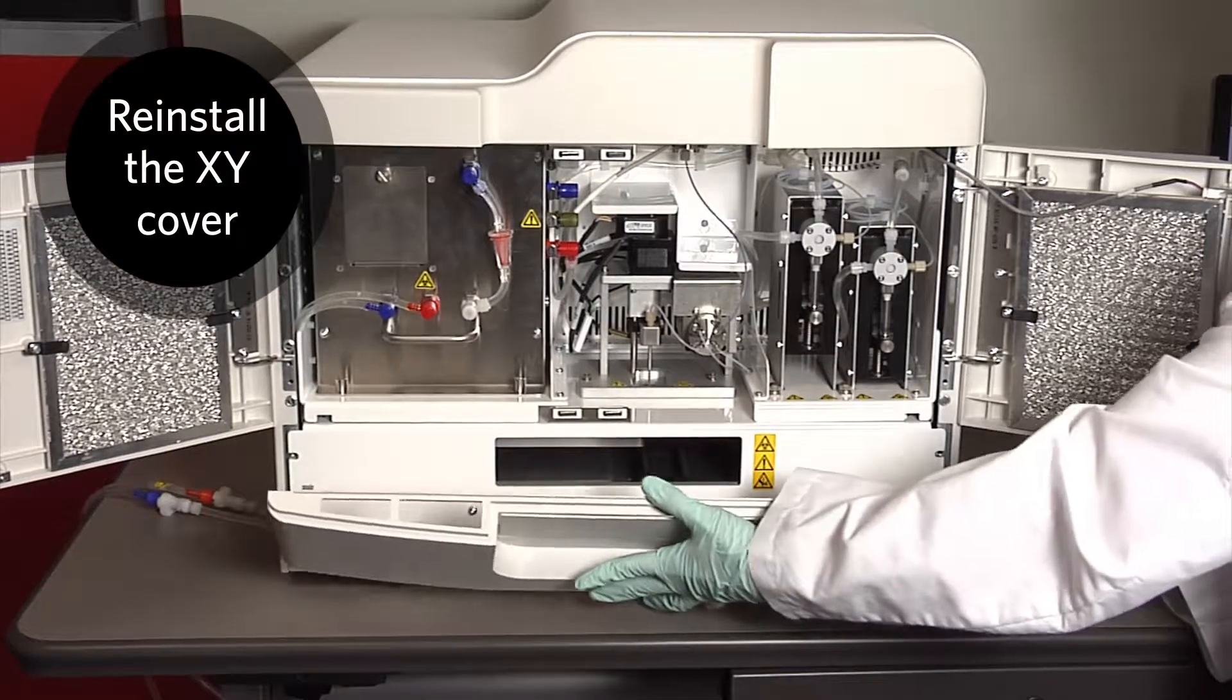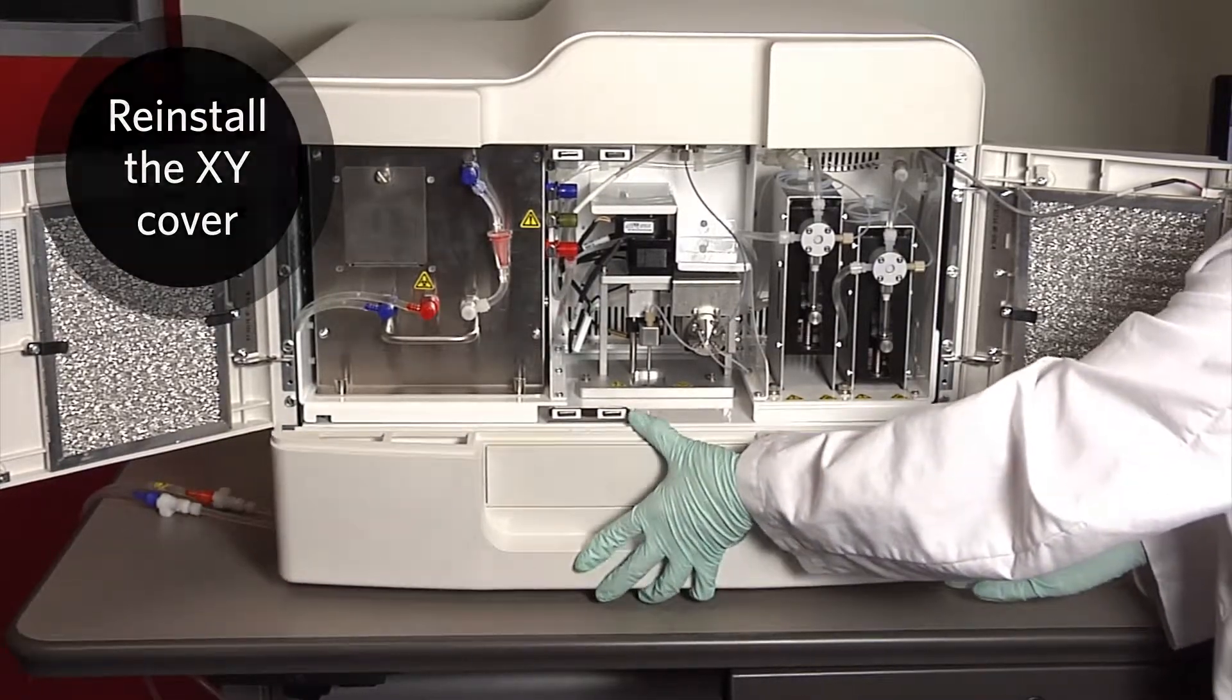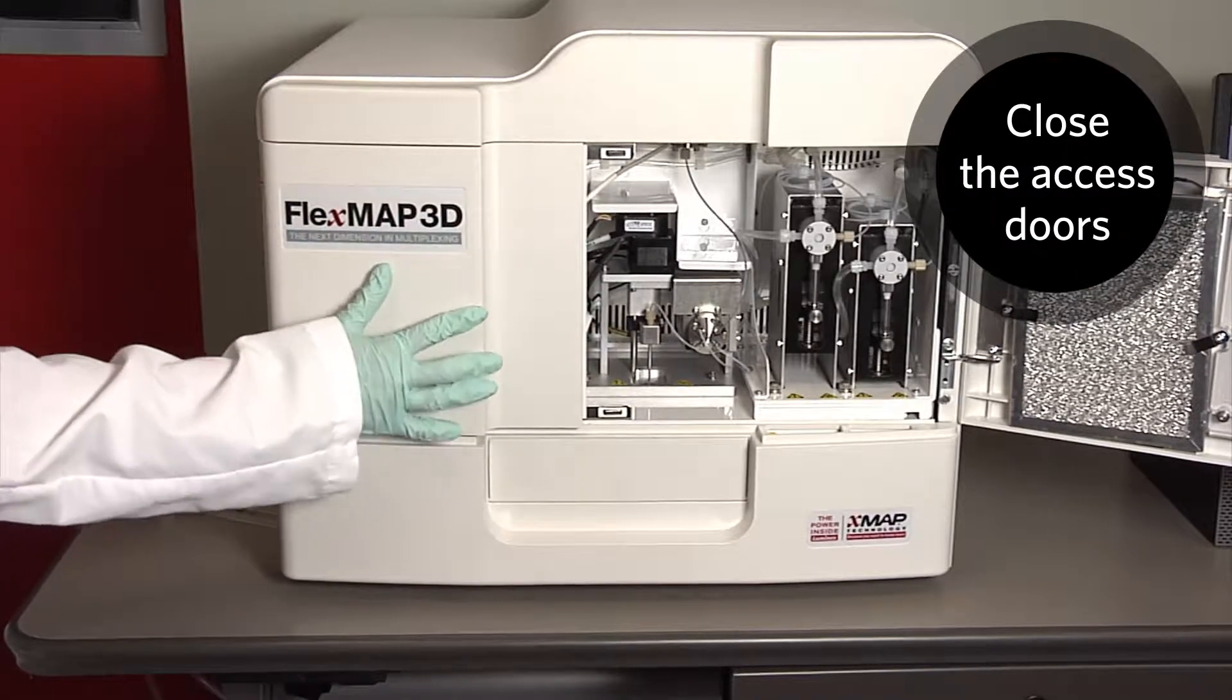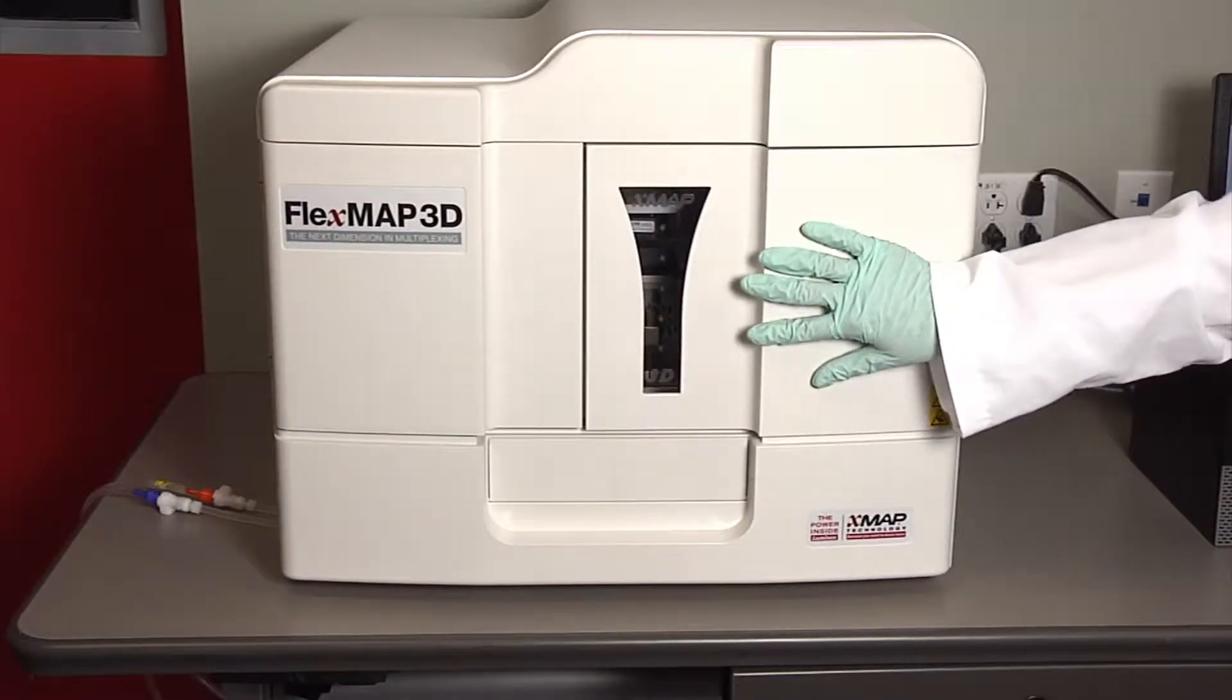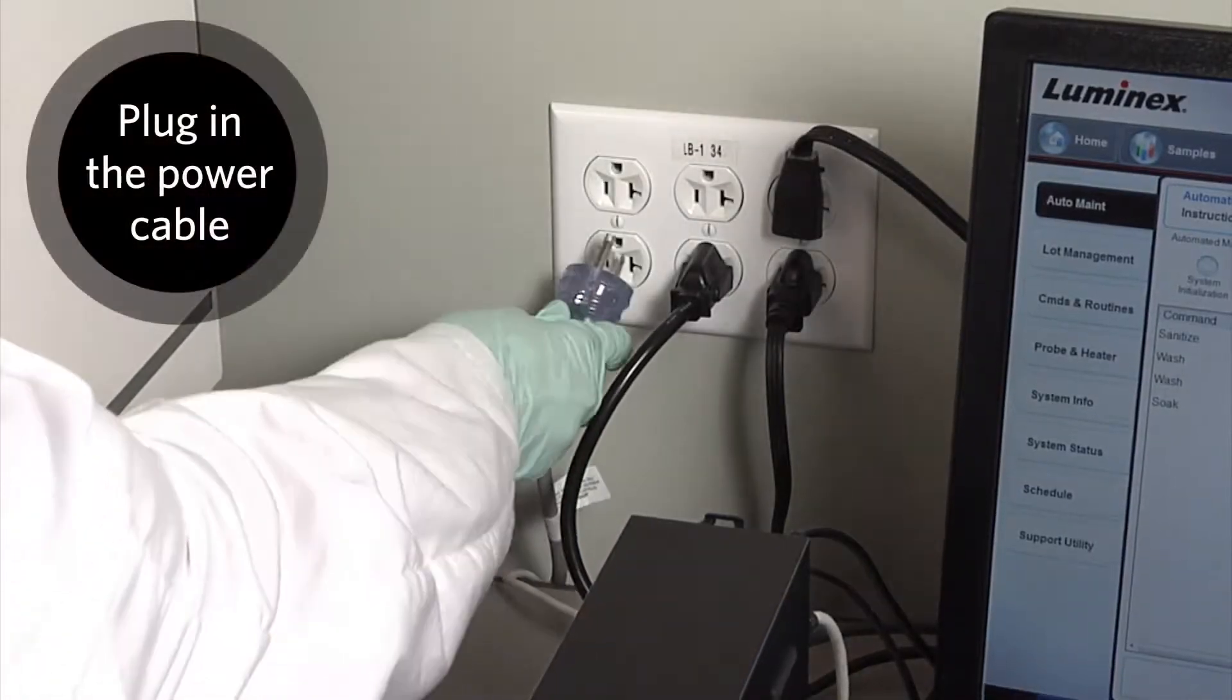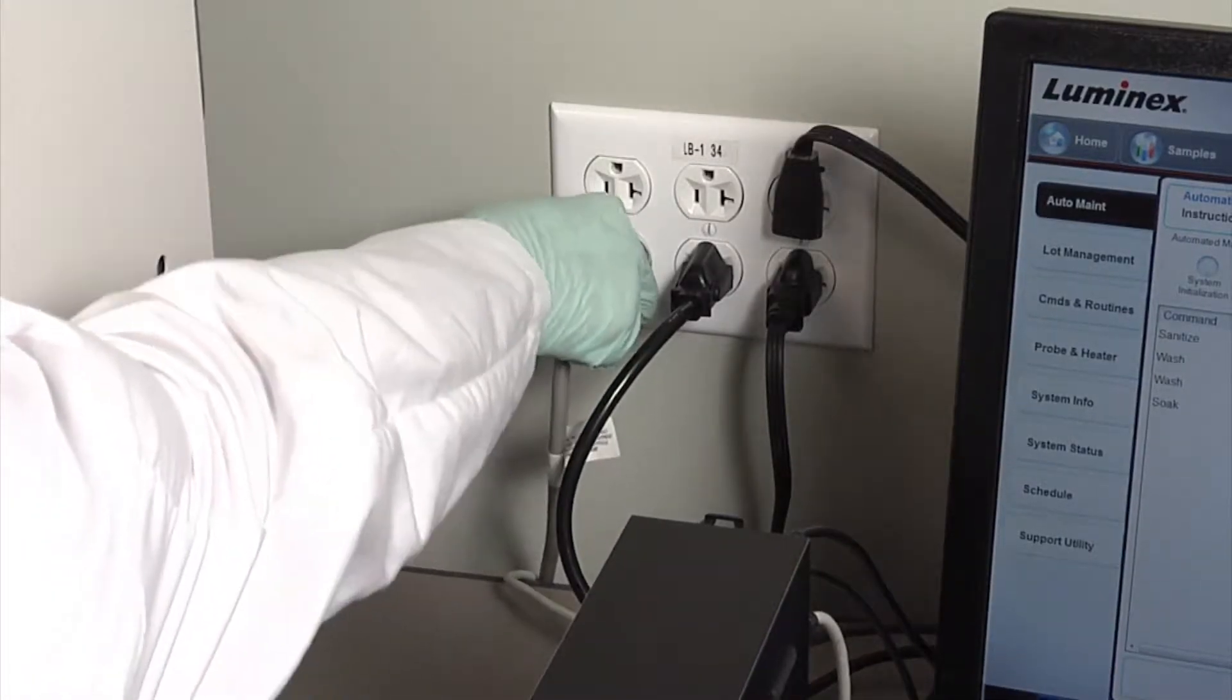Reinstall the XY cover and close the access doors. Plug in the power cord and turn on the FlexMap 3D instrument.